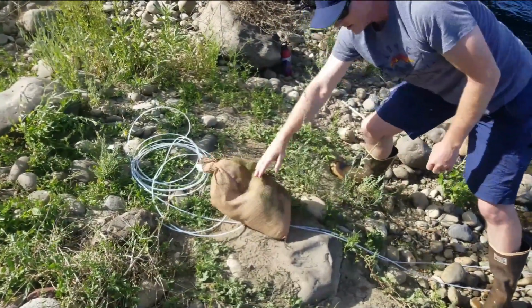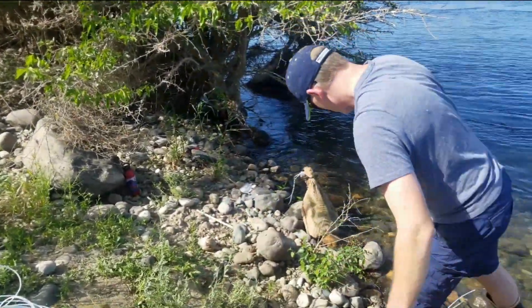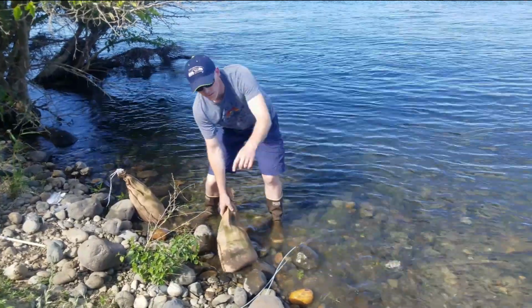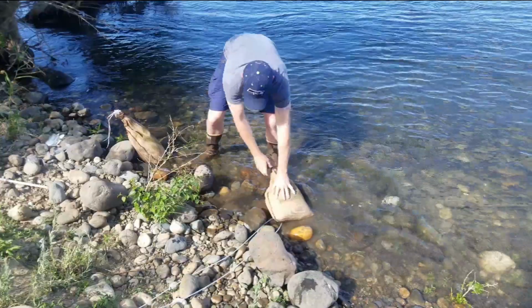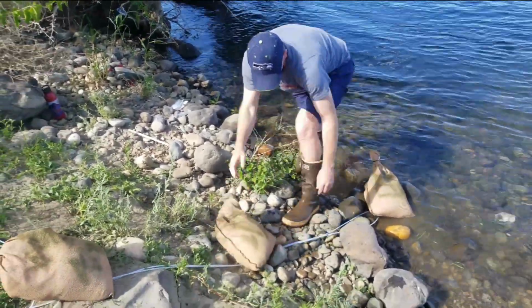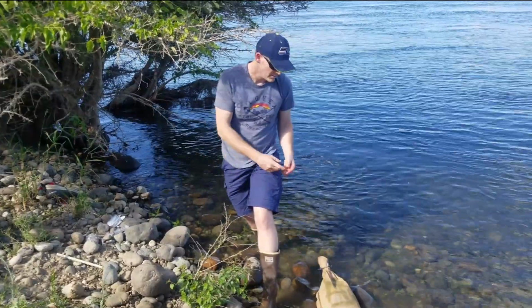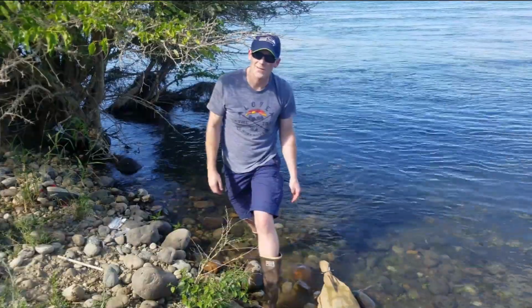Yours will be smaller than these. You can fill it with sand or sediment from your local site. And then you want to come back and secure the tubing in place along the run. In this case we have a pretty short run. Some systems might be much longer than this. We'll provide plenty of tubing for you to go the whole run, as well as plenty of sandbags to weight it down the whole length.